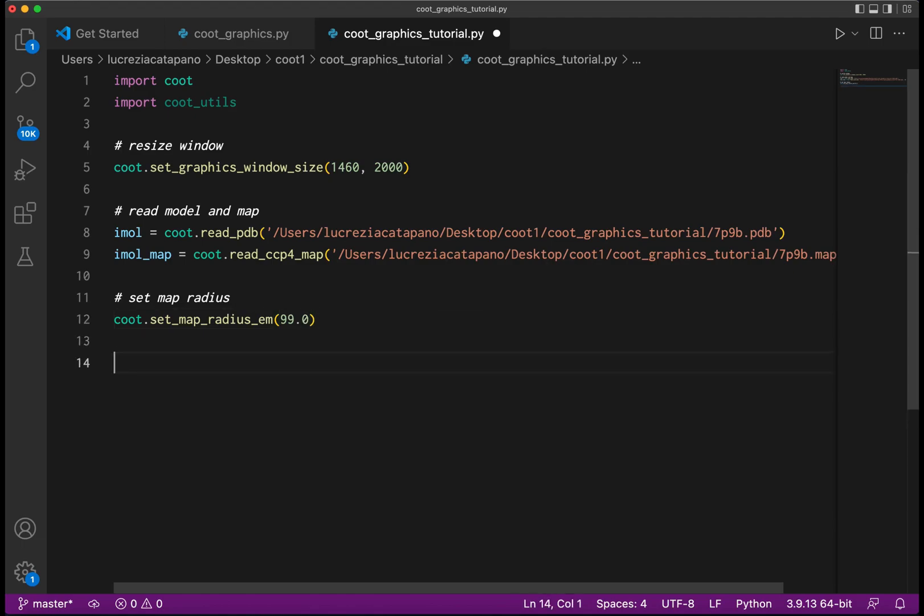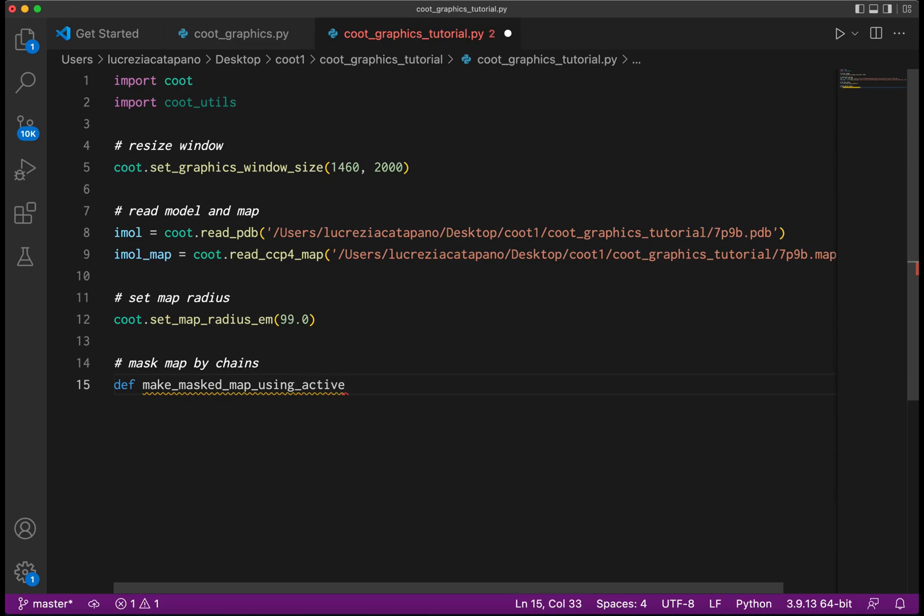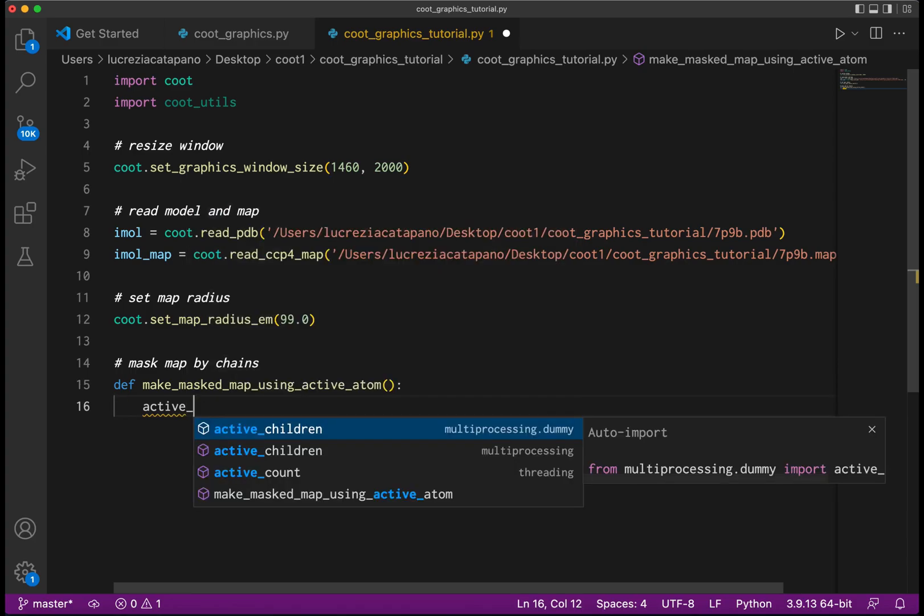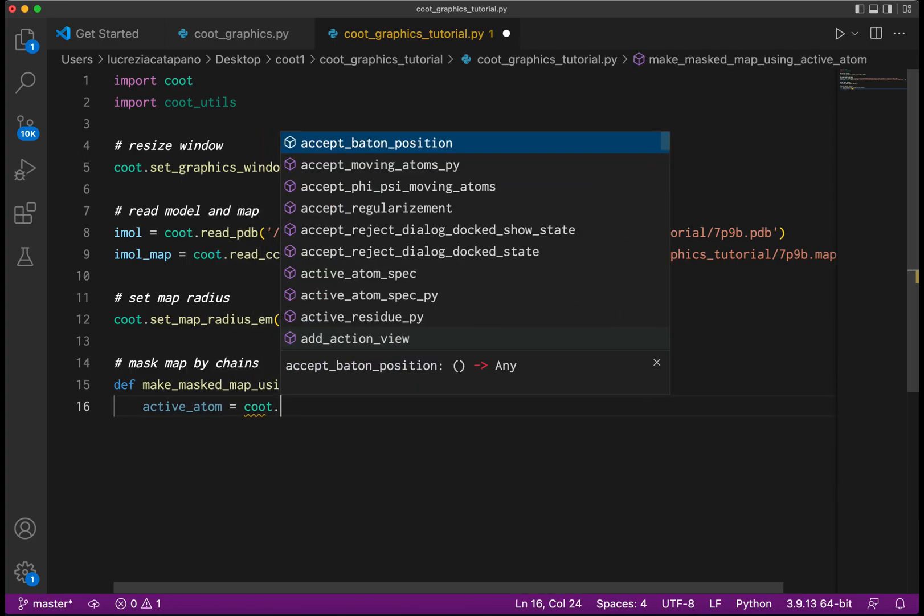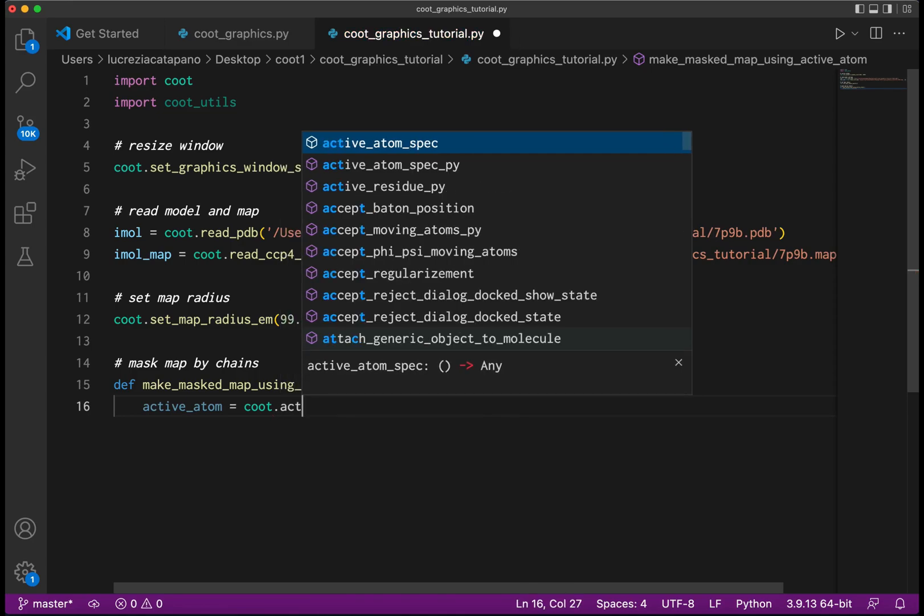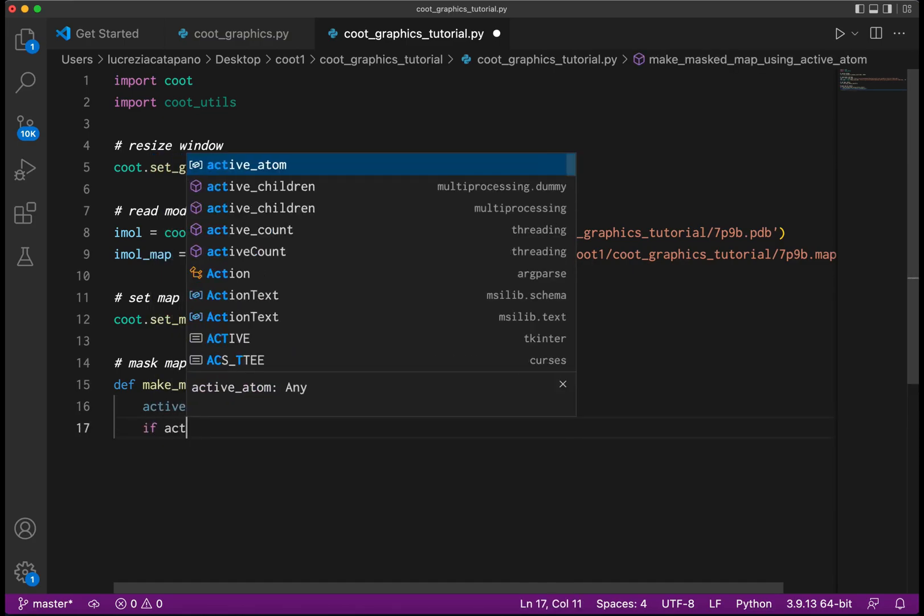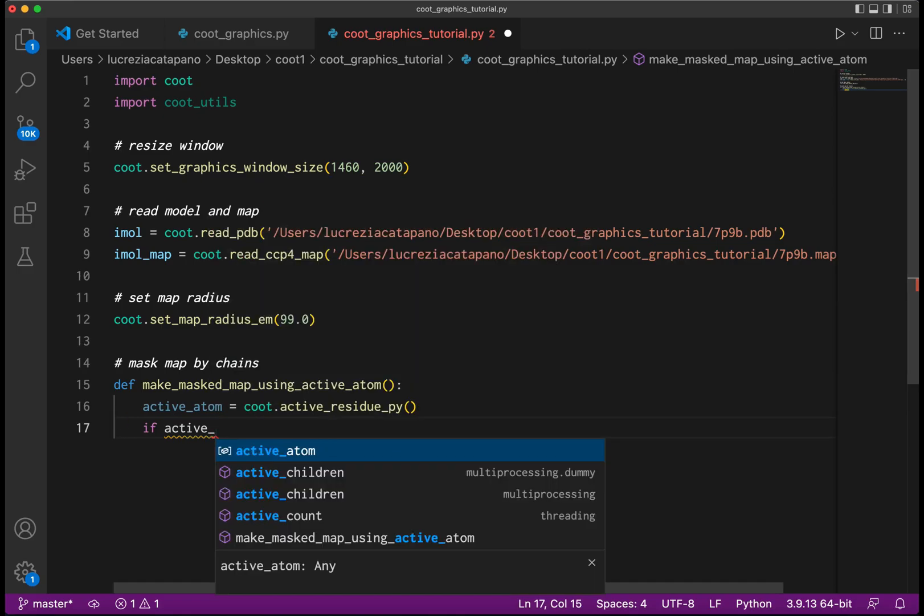We also want a multicolored map where each color represents the density from a single chain. To do that, we will create a set of maps that get masked by the chains of the model. We're creating a function to do that in the general case. There may be many model molecules that have been read, so we need to find which one. To do this we use active_residue_py, which returns the specification of an atom that is closest to the center of the screen. This is the general case of selecting the active molecule.